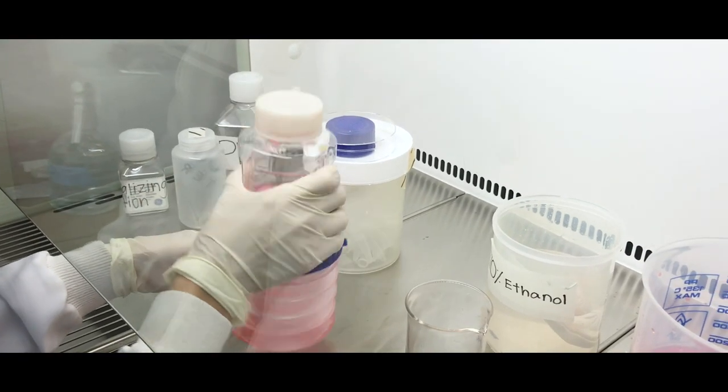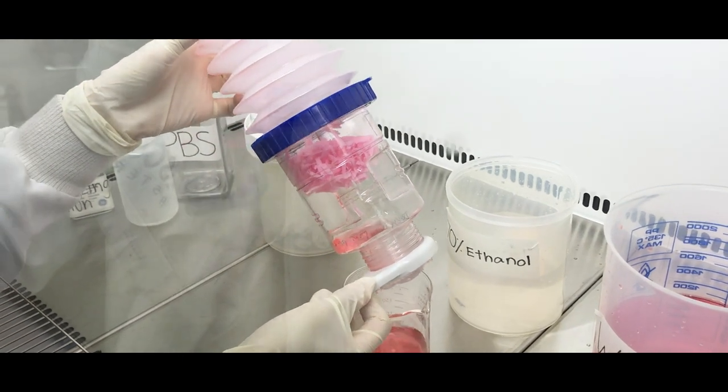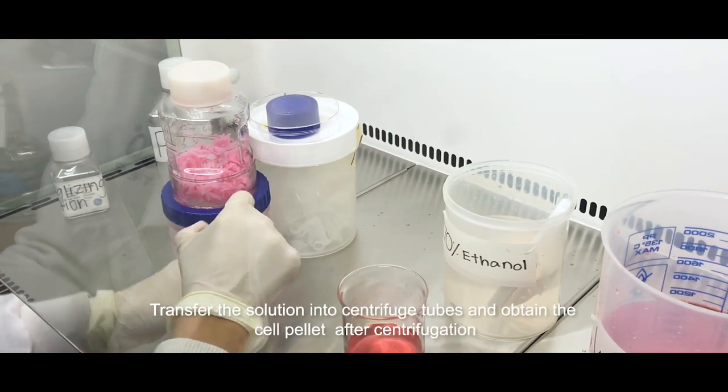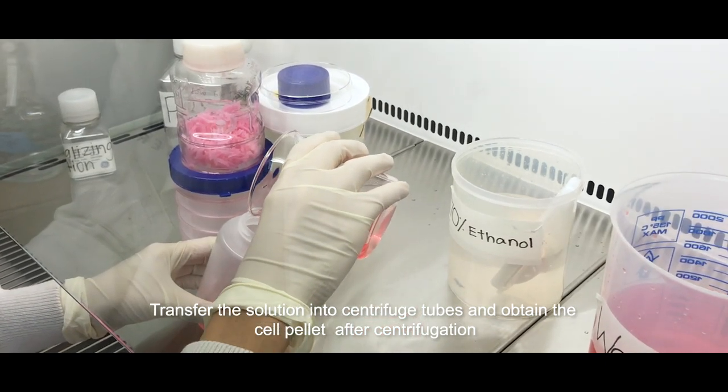Pour the cell laden solution into a clean beaker. Finally, transfer the solution from the beaker to the centrifuge tube to spin down the cells. Obtain the cell pellet after centrifugation.